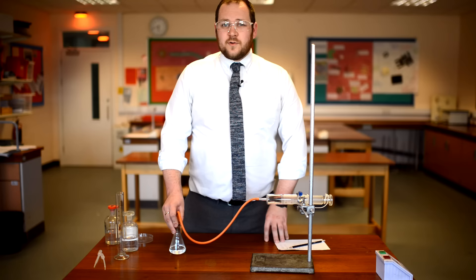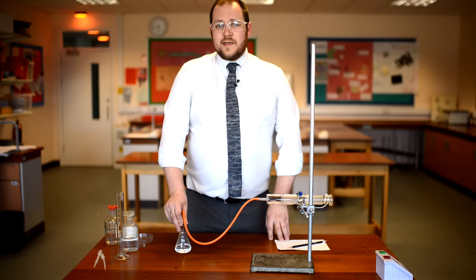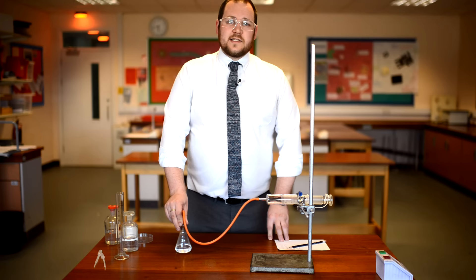Also, some hydrogen may be lost at the start of the reaction. Another source of error is that the measuring cylinder is quite imprecise because we can only read every 1 centimetre cubed of gas that's collected. If we were to use an inverted burette, this would be much more precise as we can see every 0.1 centimetre cubed of gas collected and therefore have a greater degree of precision in our results.